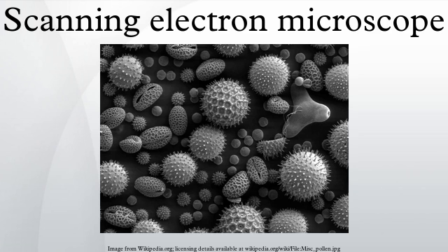Further work was reported by Zworykin's group, followed by the Cambridge groups in the 1950s and early 1960s headed by Charles Oatley, all of which finally led to the marketing of the first commercial instrument by Cambridge Scientific Instrument Company as the StereoScan in 1965.